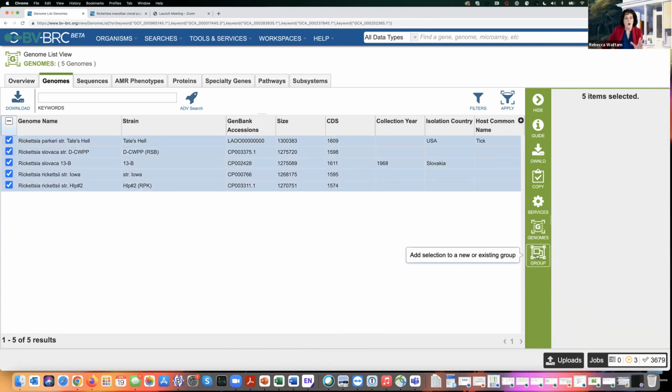Now it's not so hard when there are just a short number of genomes. But when you have like 100 genomes, you don't want to enter them individually into the service. It's like the person who had 192 paired read files that they want to enter for an assembly. Nobody wants to do all that clicking.